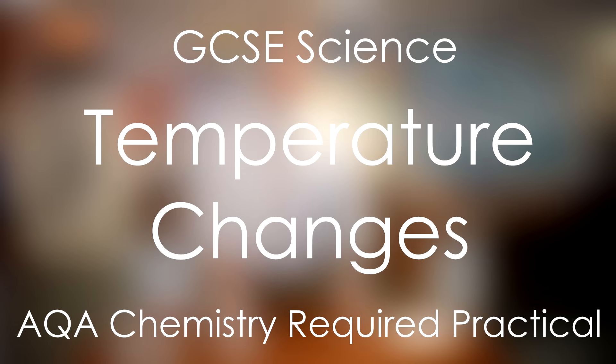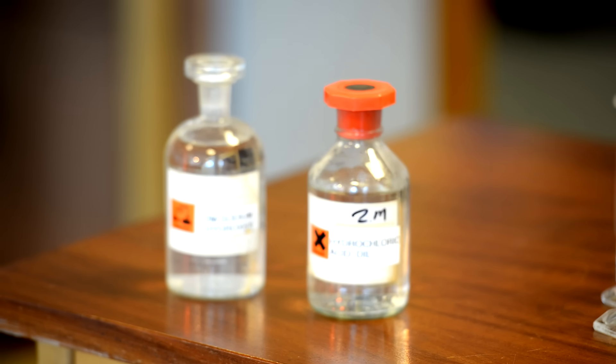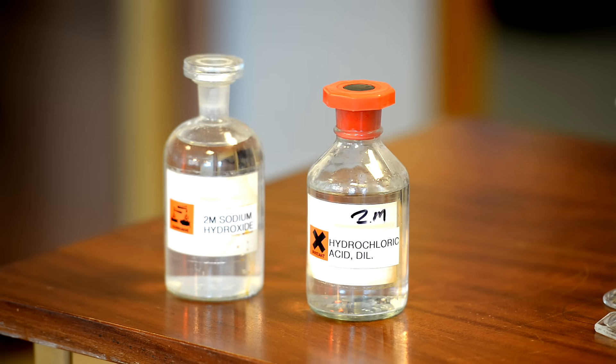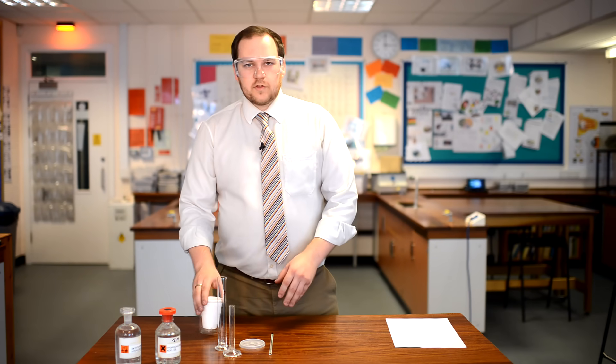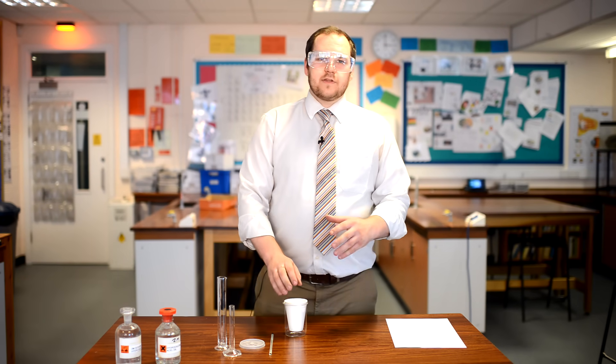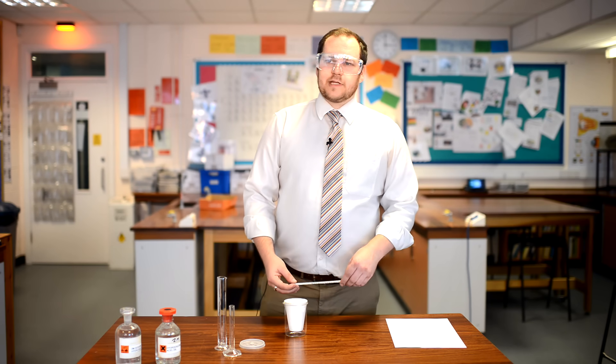Today we're doing an experiment into the temperature changes of a neutralisation reaction. We're going to be using two molar hydrochloric acid and sodium hydroxide, so I'm using my safety goggles as should you. The first thing you're going to do is take a polystyrene cup and put it into a beaker for safety, so that we don't tip it over and knock over the acid or the alkali.